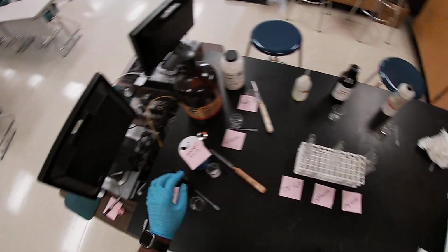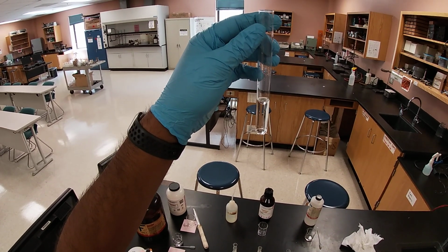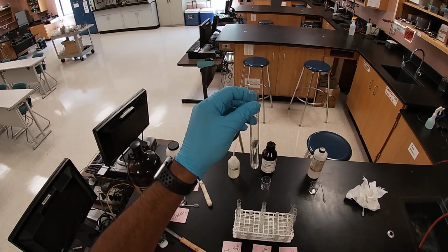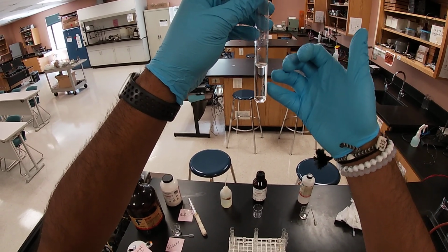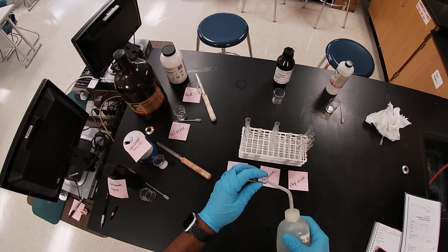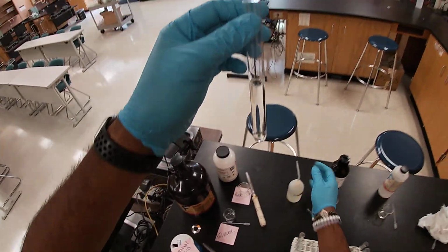And then the last one, the unknown solid, I'm sorry, the unknown liquid with water. And if you notice here, there are two layers. Just trying to figure out where the layers are. But if you look at the base, the layer is at the base. And here we have some water. Let's add some more water. And so, okay, now we know for sure where the water is.